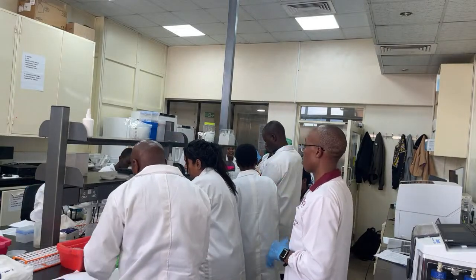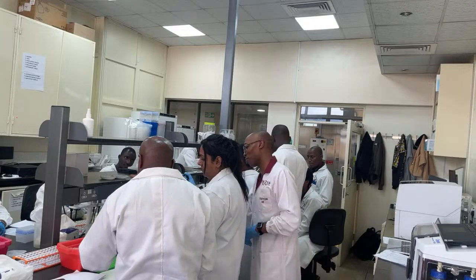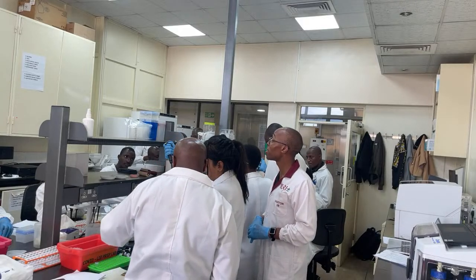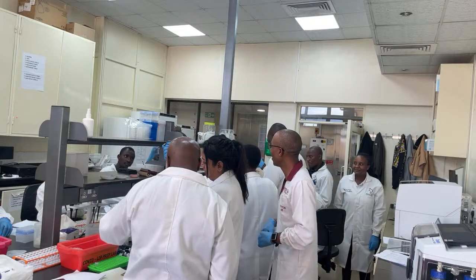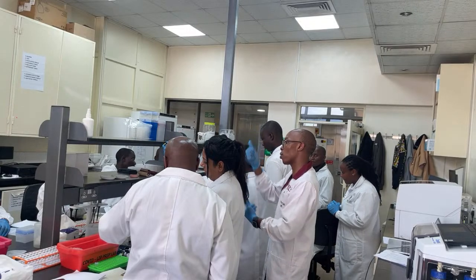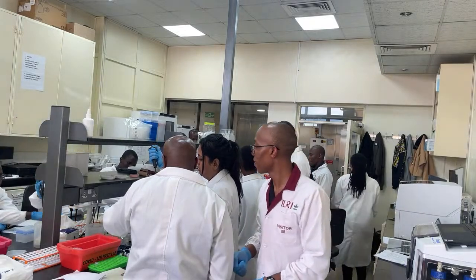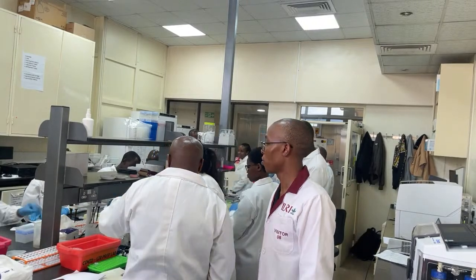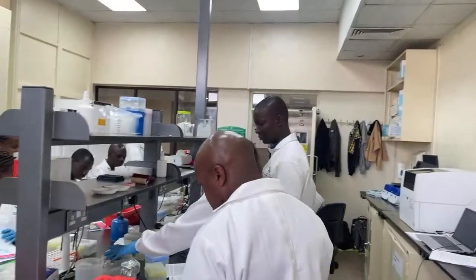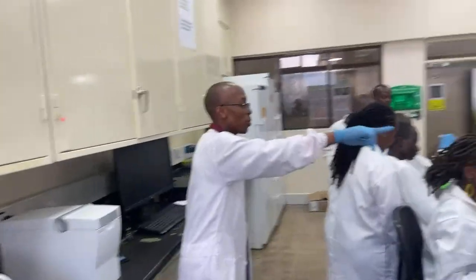For the rest of the guys, so you can screen together. Wait. Because you guys started late, so they took less people. What's the time? It's 10 minutes up. Okay, then just go straight into the liquid, extract the eluate. Then just wait for the guys there. So you just go straight into the liquid, get the liquid out into the new tube, and then we short spin again one more time.